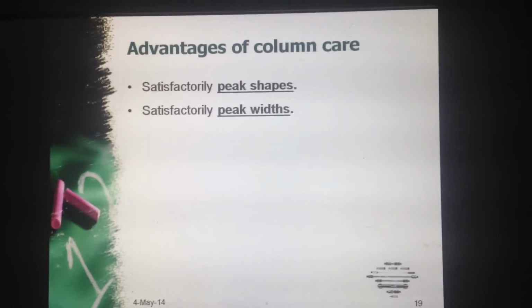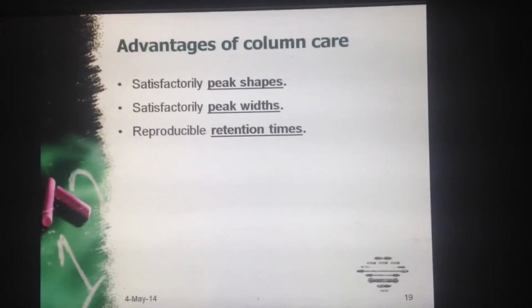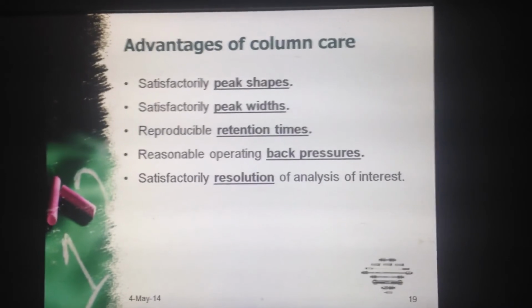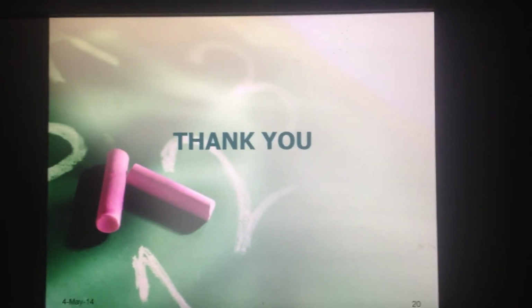Now what are the advantages of column care? Satisfactorily peak shapes, very important point. Satisfactory peak widths, reproducible retention time, this is also a very important point, reasonable operating back pressure, satisfactory resolution of analysis of interest, stable detector baselines, and thank you.